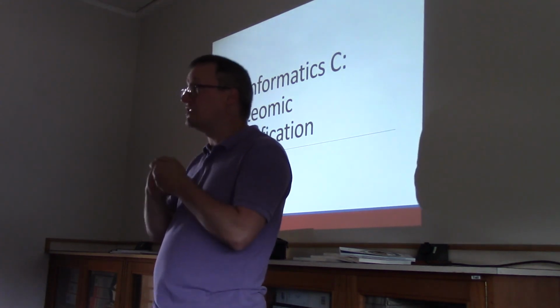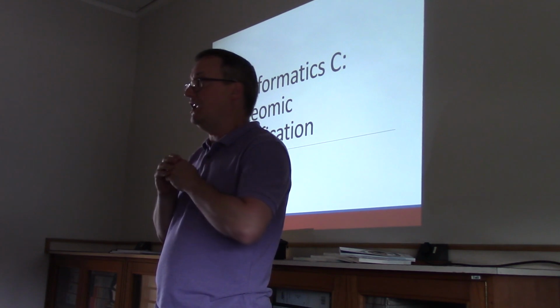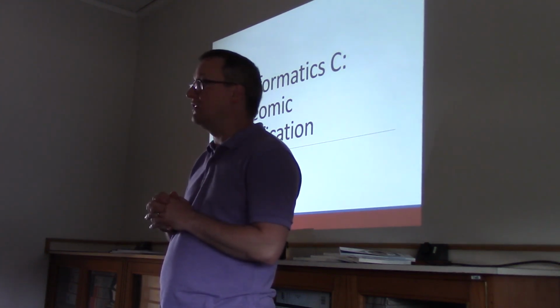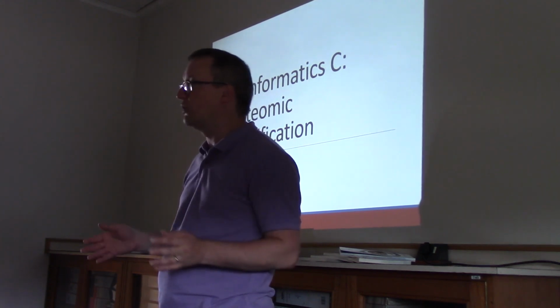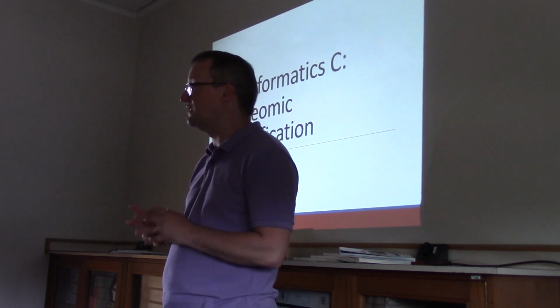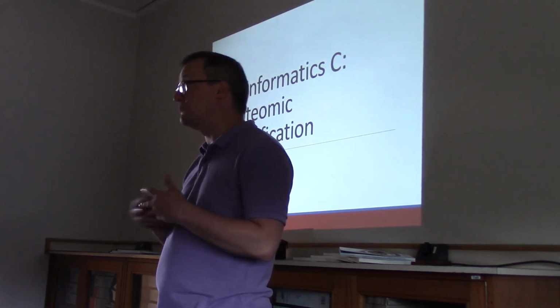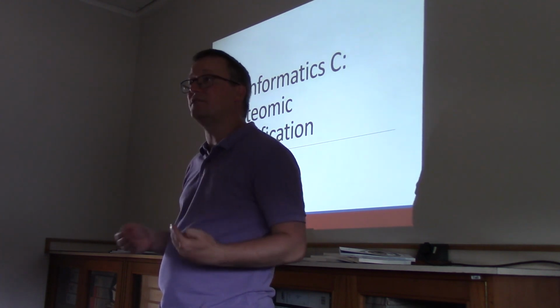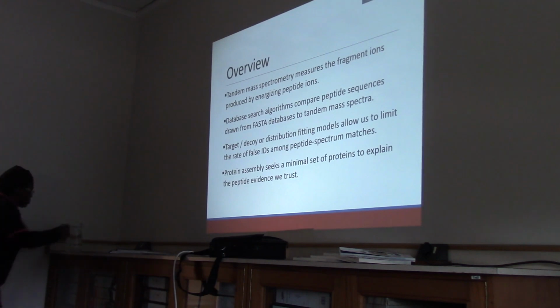But in fact, the use of sequencing data to identify proteins is a huge theme within bioinformatics, and a very large community of bioinformatic researchers around the world have been focused on problems in understanding mass spectrometry data sets for a long time now. So I'm really glad that you're going to get some exposure to how we go about identifying proteins.